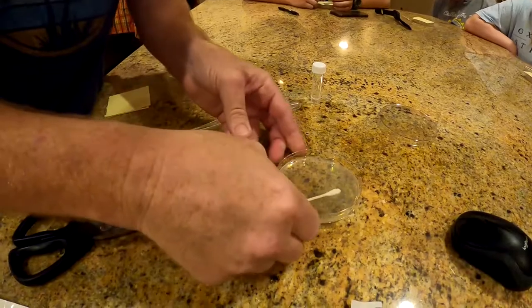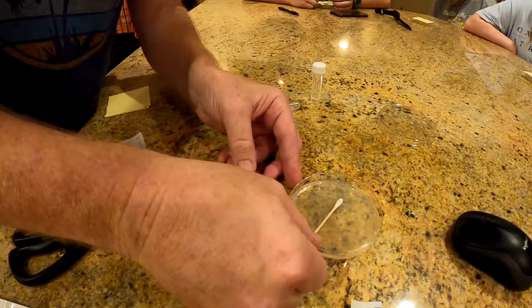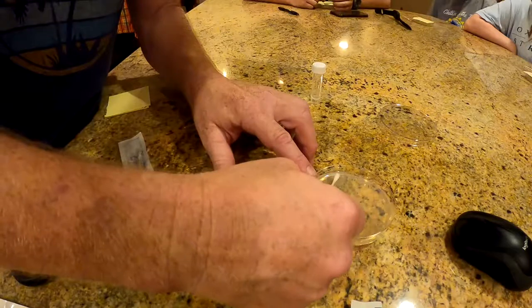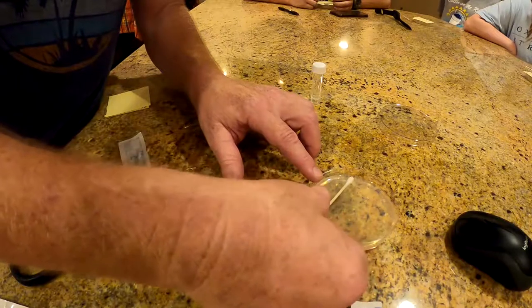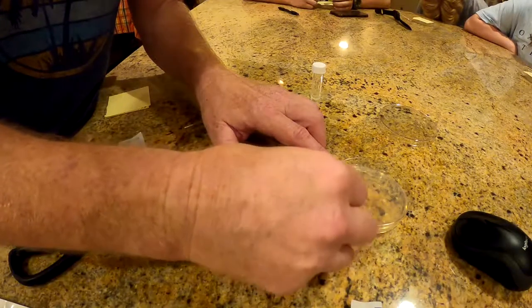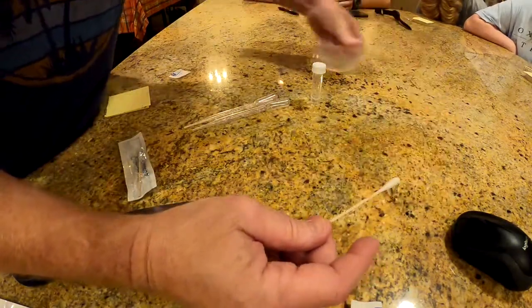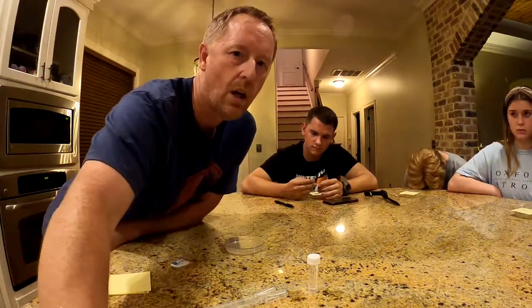Here's the proper technique: put your Q-tip on the agar and gently roll it around, making sure every part of the Q-tip touches the surface. Make two stripes across the dish. Don't jab the Q-tip in — you just need contact, not to tear up the agar. Then we'll seal the tray and add a couple more samples tomorrow.